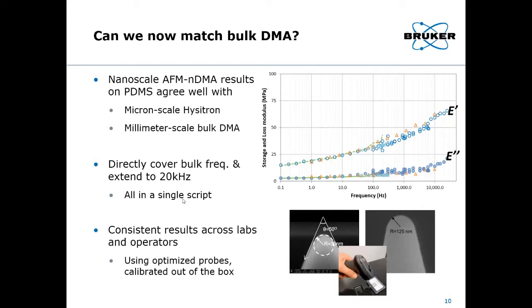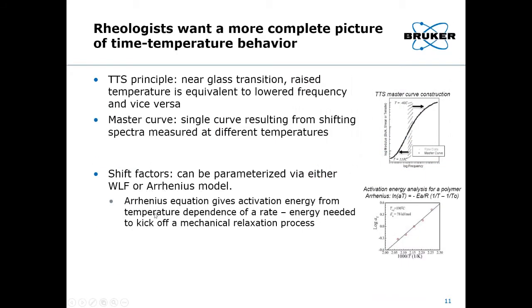Right. So in that case, again, we did not actually measure at 10 to the 18. What we did is instead we measured over a range of temperatures and a much narrower frequency range. The frequency range that we actually measured in was 0.1 hertz up to 300 hertz. At elevated temperature, at room temperature and the highest frequency, the 300, when it's translated, we are able to get to that frequency.